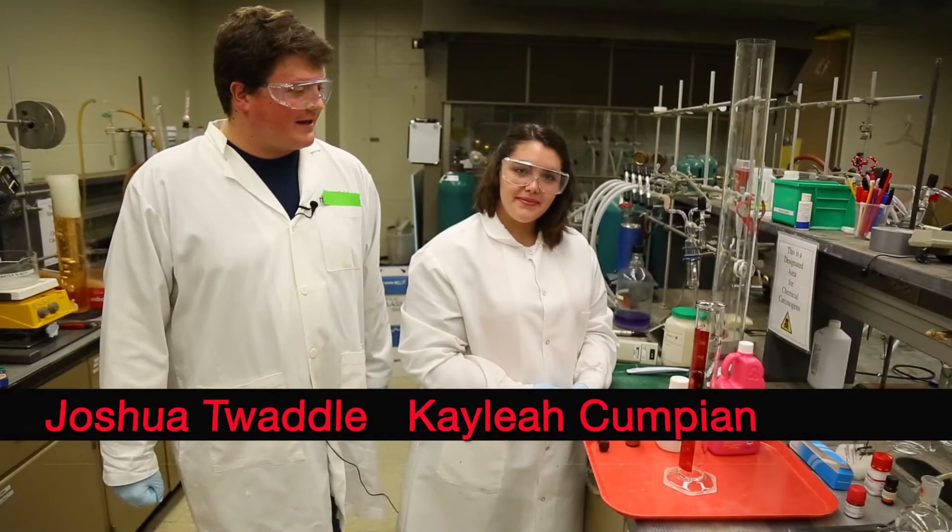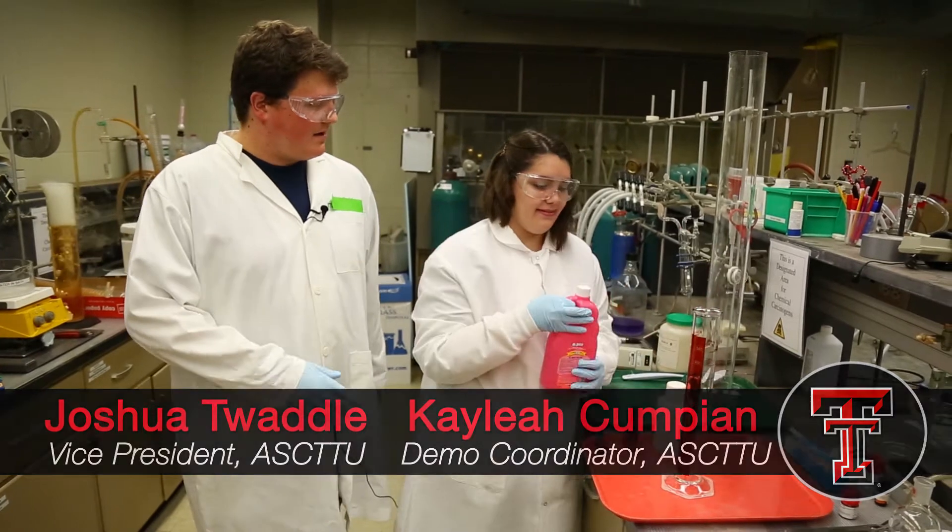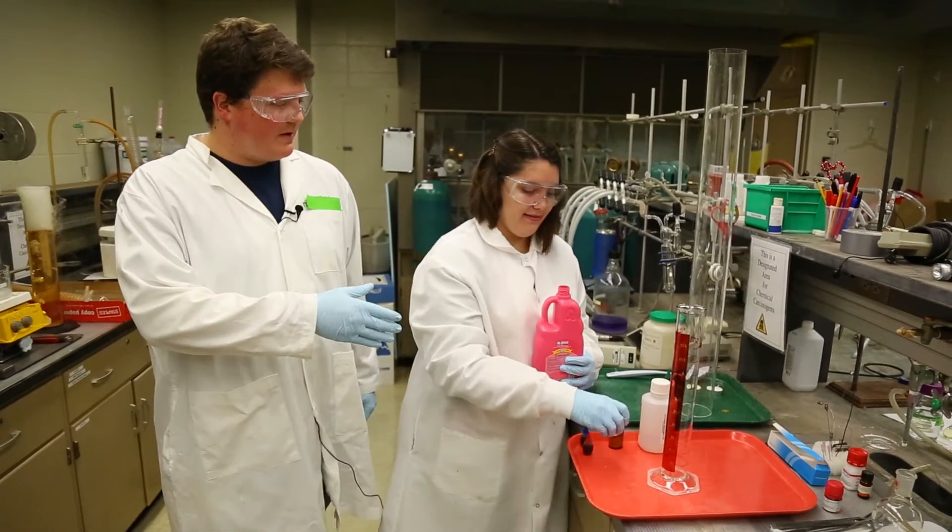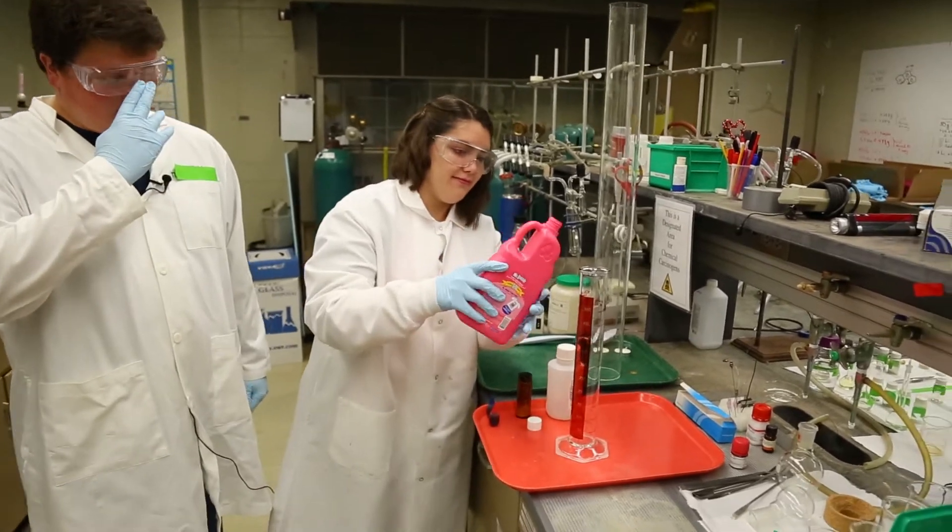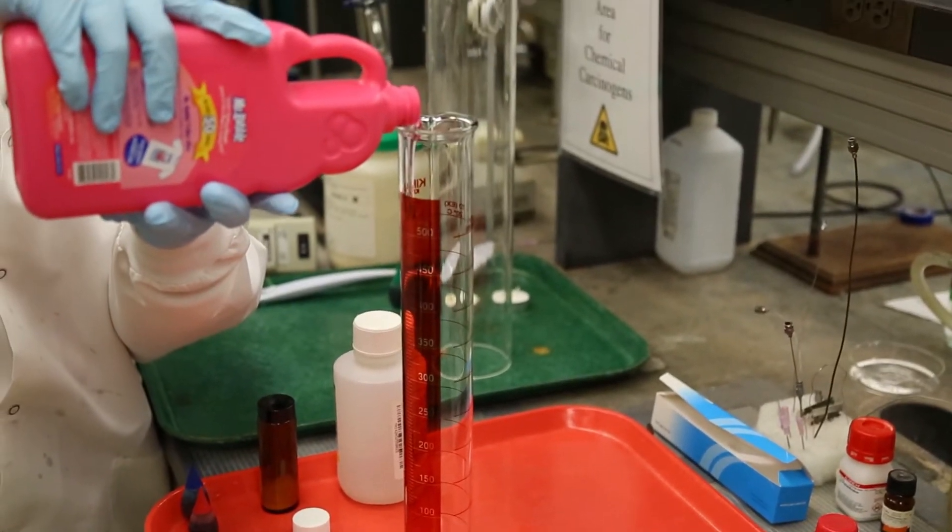So the reaction we'll be performing is called elephant toothpaste. And so what we're going to do is we're going to take Mr. Bubble bubble soap and we're going to put that into the graduated cylinder. And what we're going to try and perform is an oxidation reaction.